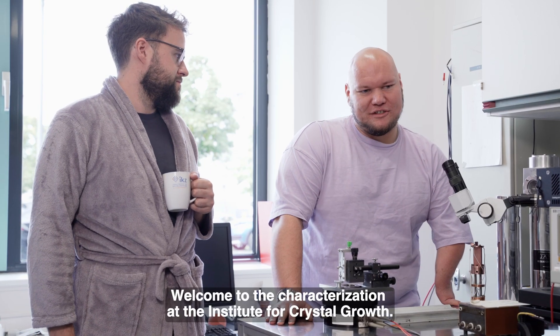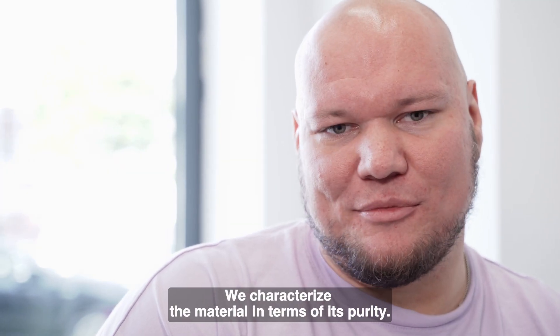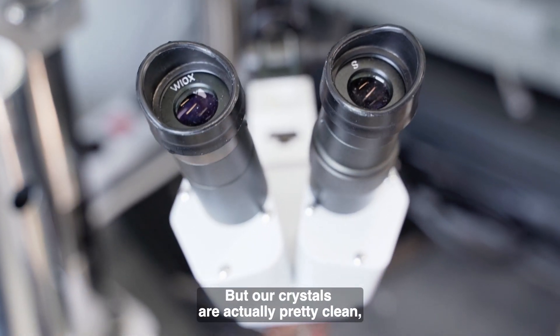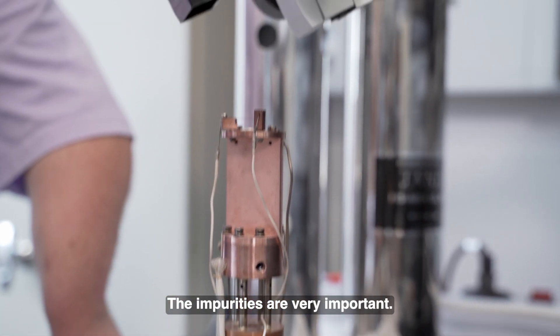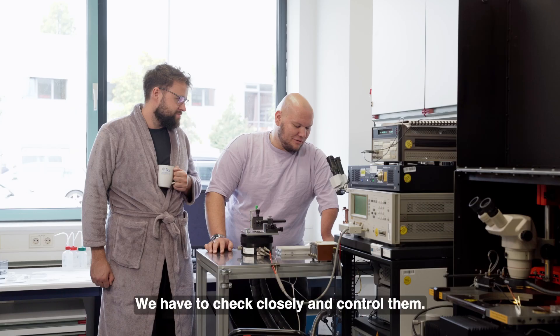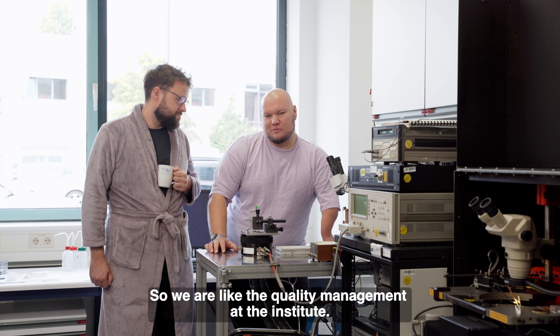Welcome to the characterization at the Institute for Crystal Growth. We characterize the material in terms of its purity. We're checking for impurities — which is dirt in the crystal — but our crystals are actually pretty clean. So we have to look very closely and use electrons to look at this, since the impurities are very important: they are responsible for the properties of the material. We have to check closely and control them, so we are like the quality management of the Institute.